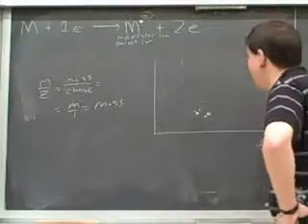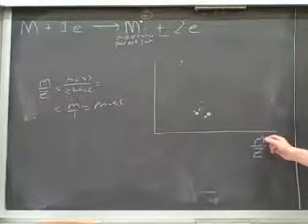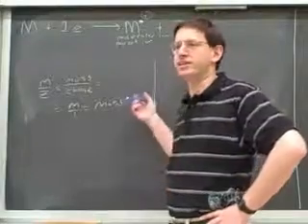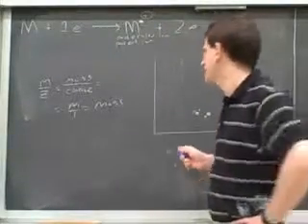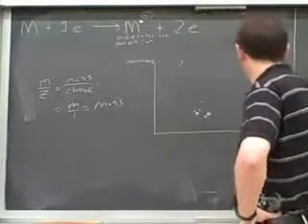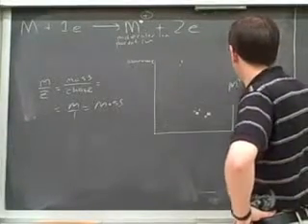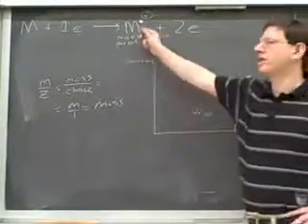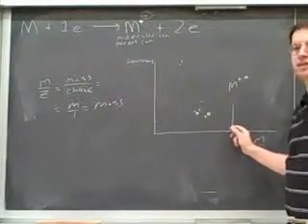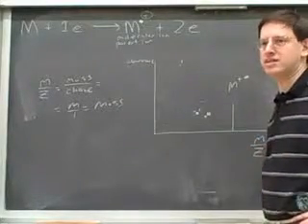So for example, this horizontal axis here tells us basically the mass of the particles that are detected. And the vertical axis is basically a measure of abundance, how many of the particles are making it to the detector. So for example, the molecular ion will give us a peak like this that shows how many of the molecular ions are getting to the detector. And then we can look at the horizontal axis to see what the total mass is here.